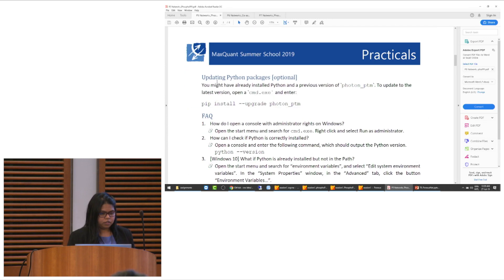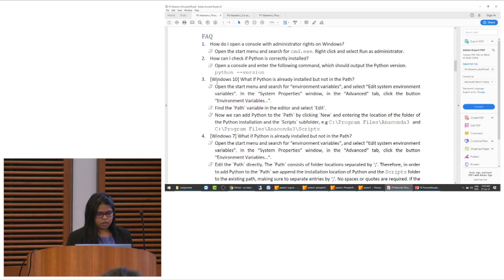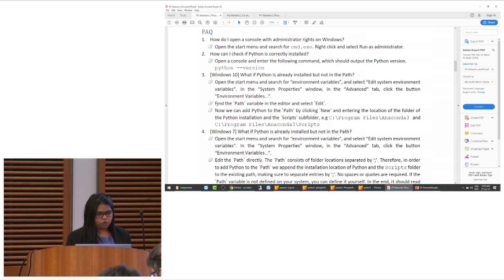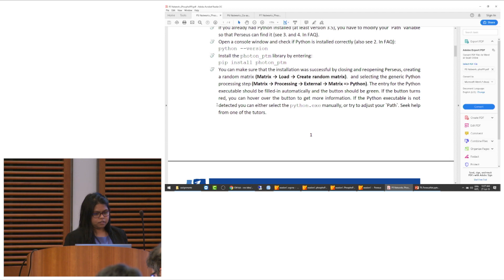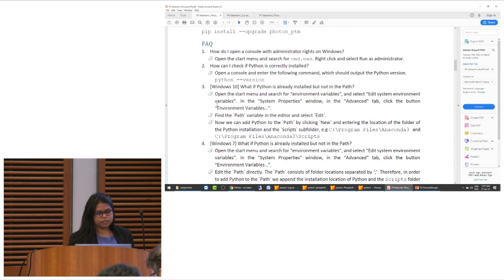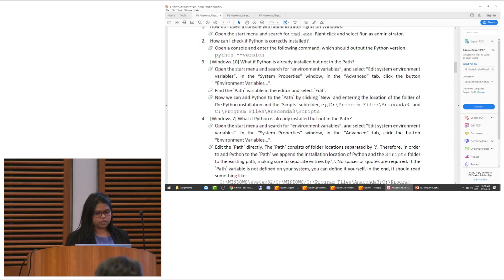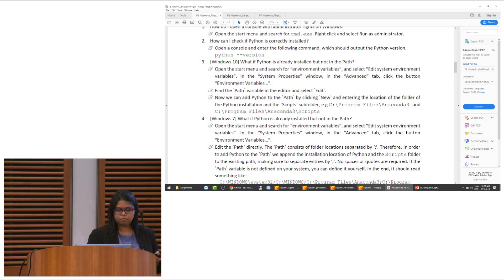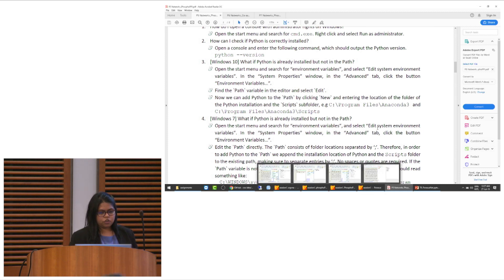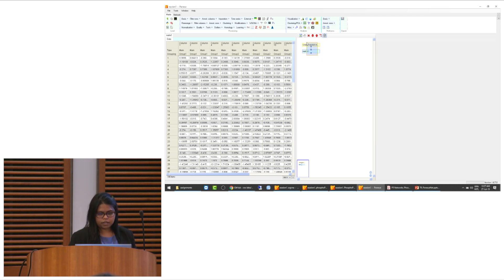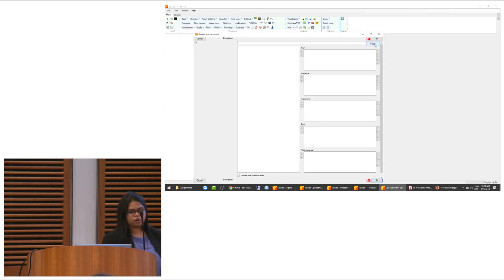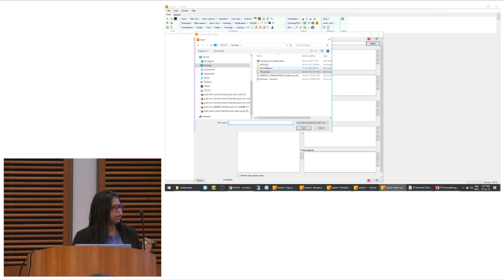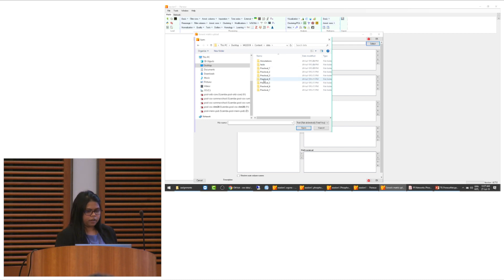To confirm that Perseus and Python are working, load a random matrix, then go to the External tab and click 'Matrix to Python'. If the select button is green, your laptop has recognized the path of Python. If not, you can browse to your Python executable. You can do the same with R — if your laptop path is set for R, it will be found automatically; otherwise, browse to the R executable.